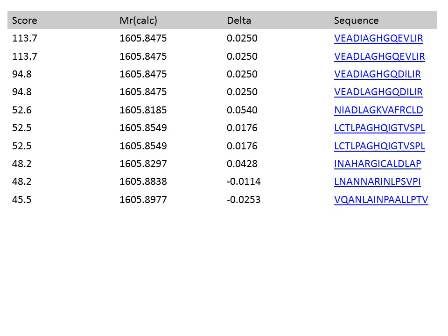For this particular parent ion, there were a number of matching sequences with a good score. In fact, the top two hits have identical scores, and a look at the sequence reveals why. Leucine and isoleucine have exactly the same mass. They are isobaric. Thus, from the data, even with a complete series of B and Y ions, we still would not be able to tell which one of these peptides is the match. We would have to decide which is correct from other identified peptides in the sample.